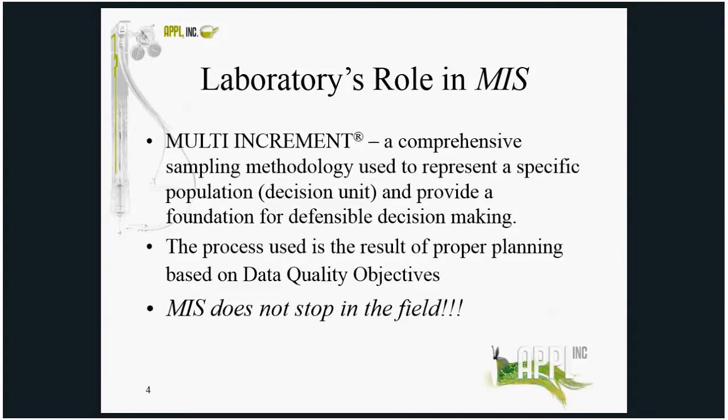Typically, the greatest proportion of overall sampling error is expected to be associated with field sample collection and/or field sample processing methods. These errors can be minimized using Gy's sampling theory in the field. However, errors attributed to incorrect lab sampling, or subsampling, of bulk samples can also be very significant and in fact could be orders of magnitude. So correct lab processing of MI samples is also critical.